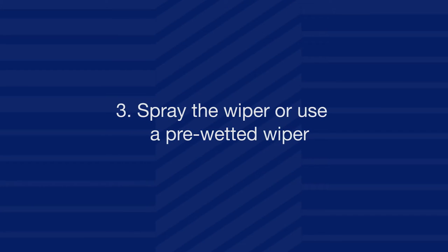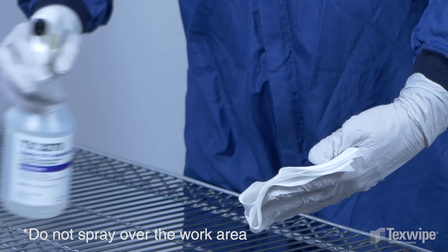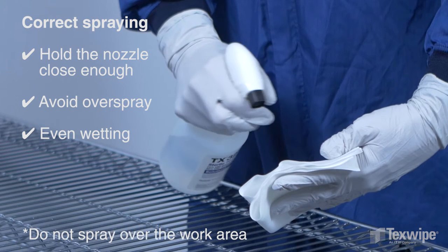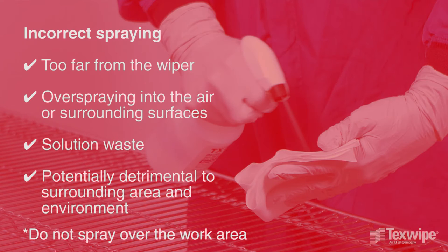Step 3: spray the dry wiper or use a pre-wetted wiper. Wetting the wiper requires holding the spray nozzle close enough that the spray pattern covers the wipe, but not too far away to create overspray. Overspraying surrounding surfaces or into the air is a waste and potentially detrimental to the surrounding area or environment.